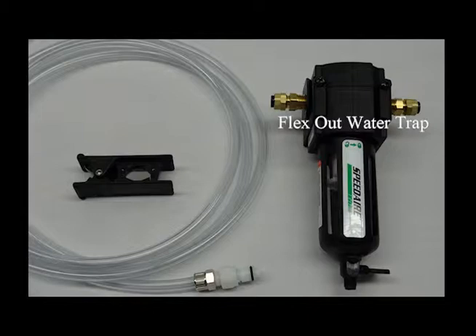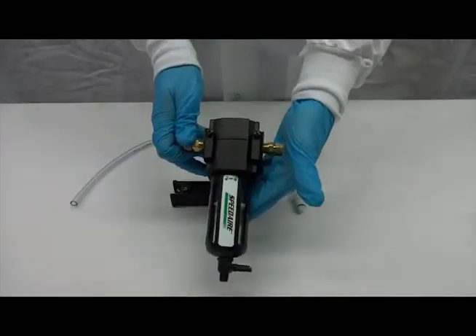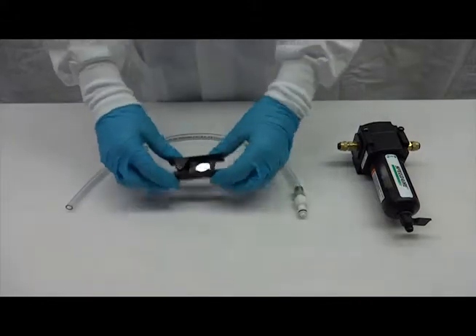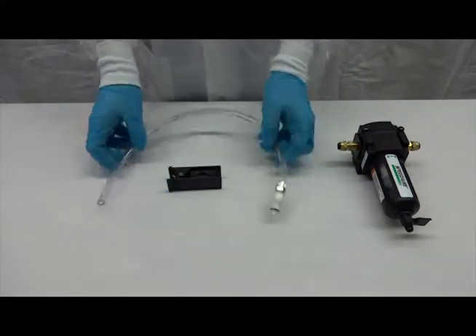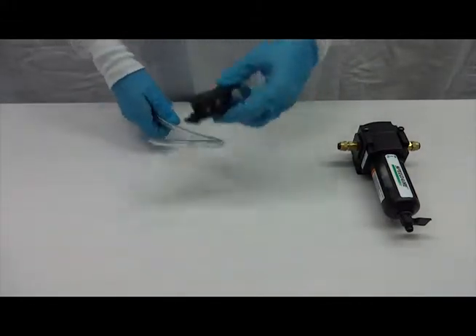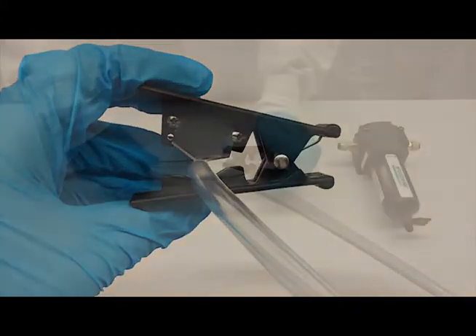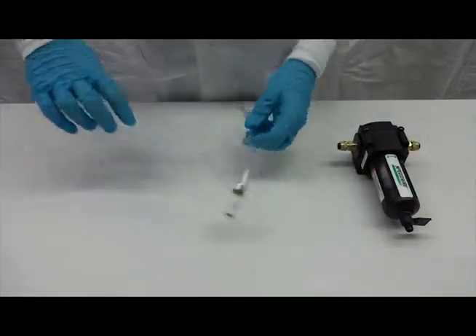The flex out water trap has three 1/8 inch brass fittings connected. To connect the flex out water trap in line with your flex out tubing, cut the length of the flex out tubing between your base plate and flex link controller as near as possible to the base plate, remaining outside of the incubator so that the water will be trapped away from the flex link.